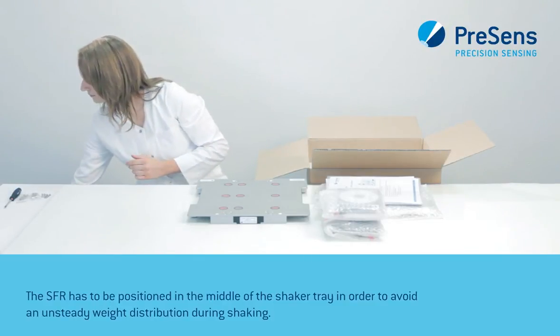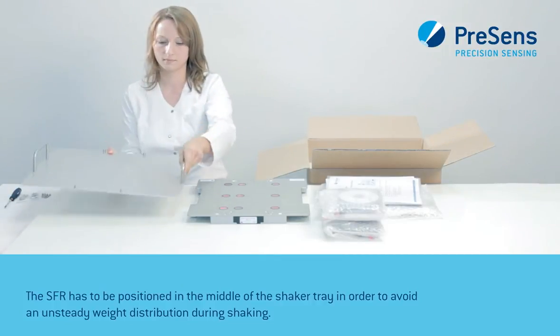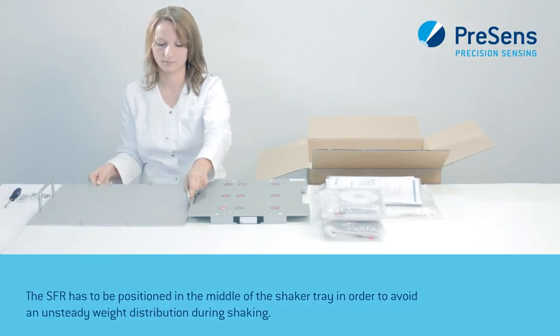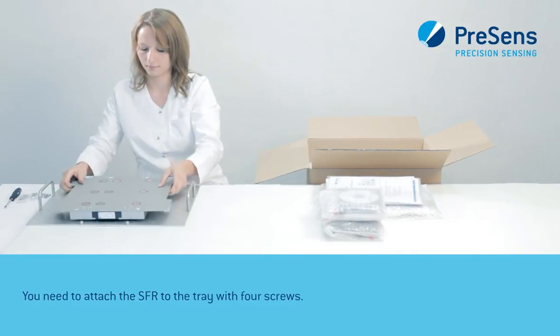The SFR has to be positioned in the middle of the shaker tray in order to avoid an unsteady weight distribution during shaking. You need to attach the SFR to the tray with four screws.